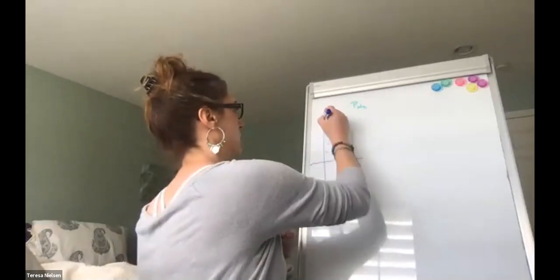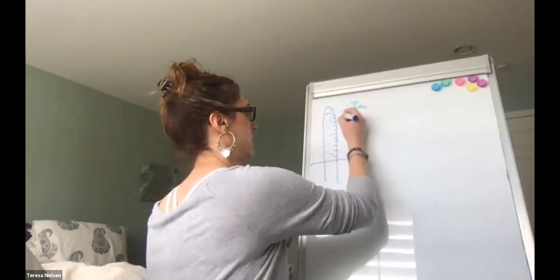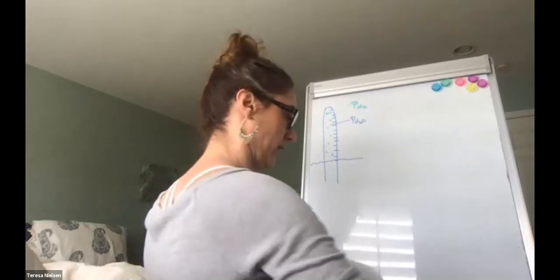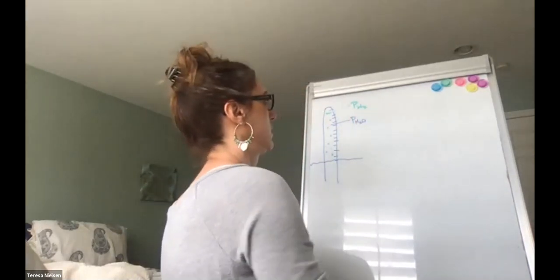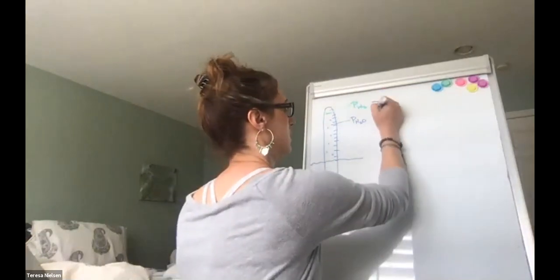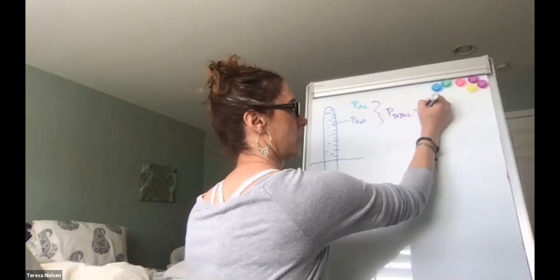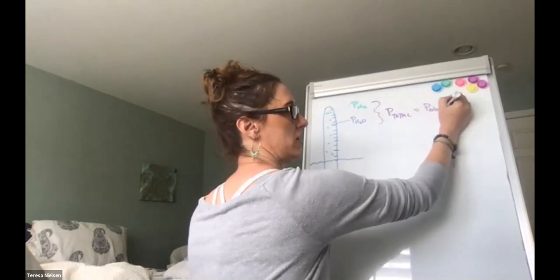We also have some water vapor up in here. And so we can say that this total pressure is going to be equal to the atmospheric pressure, because the water levels are equal inside and out.